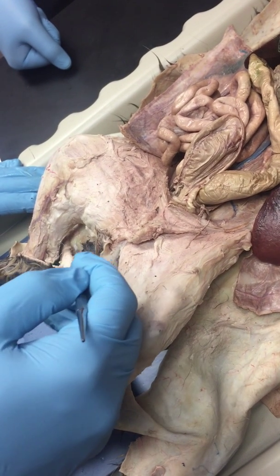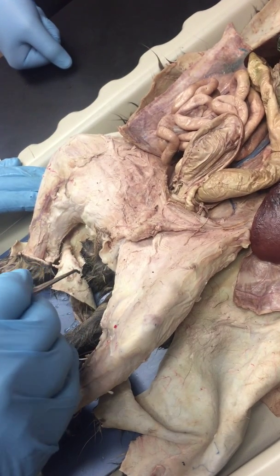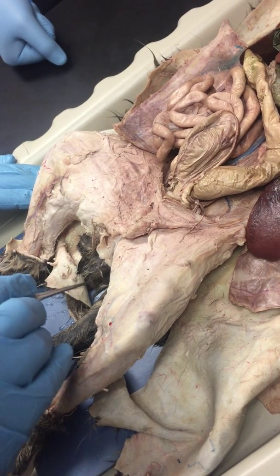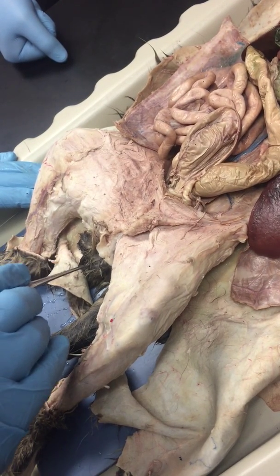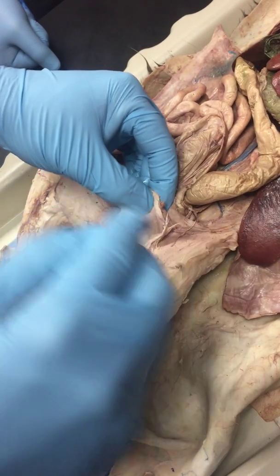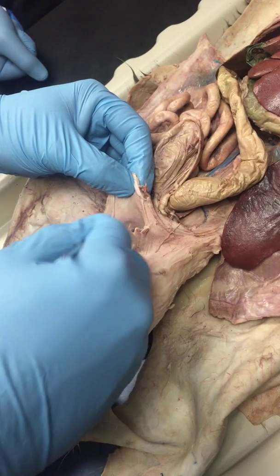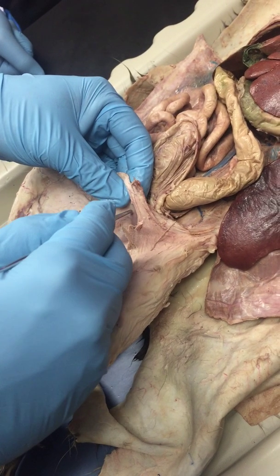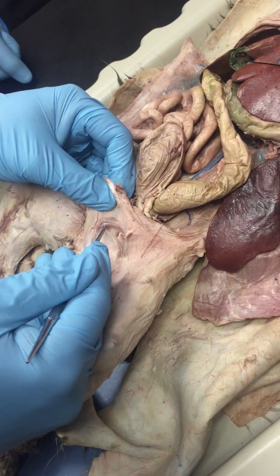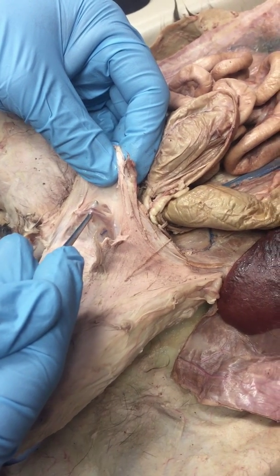Now cats, you know, they're pretty small. We have the penis right here. Here is the scrotum that is just a sack of skin that contains the two testes. Now, sperm cells are produced in the testes, and then they pass through two tubes called the semen tubes, or the actual scientific name for them is vas deferens. And here's the vas deferens right here in this fat stuff. So you guys are going to pull all this fat off, but keep the tubes right here.